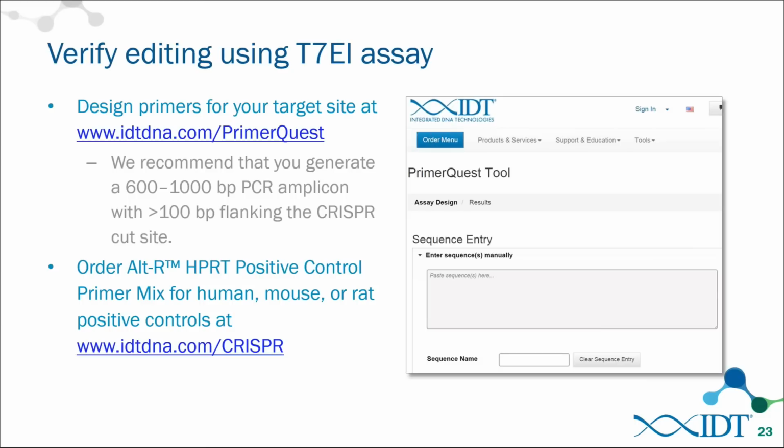As mentioned before, this would eliminate any complications of edits as it would impact the binding of the primers for amplification. In addition, it allows for detectable fragments of 100 base pairs or larger to be resolved on a gel.